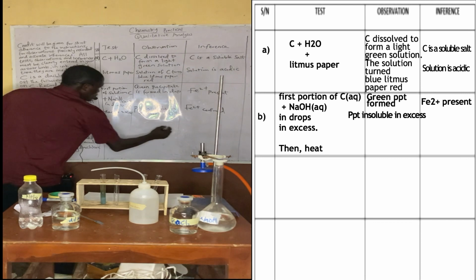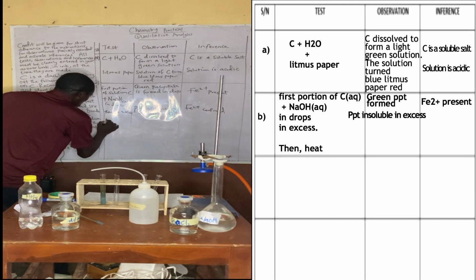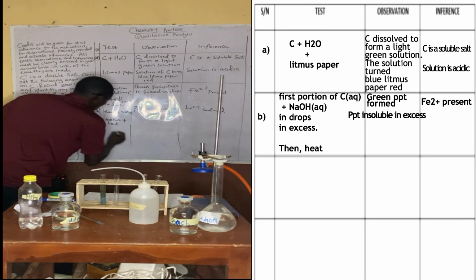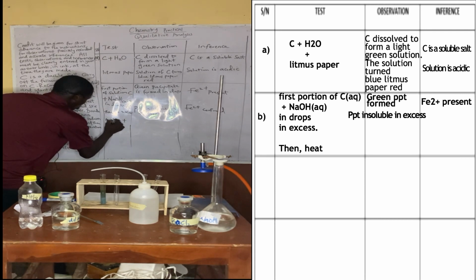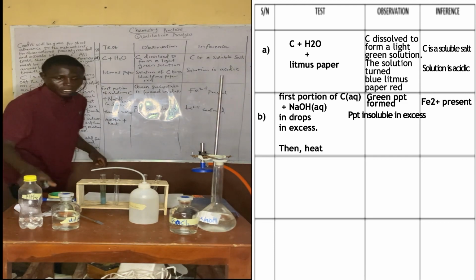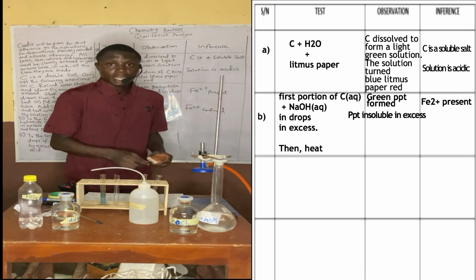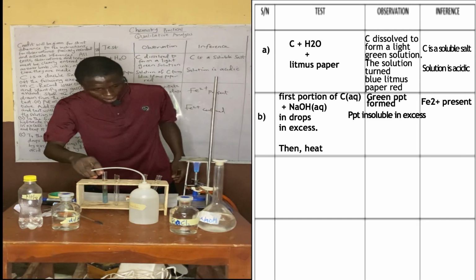Now, the mixture plus heat. Let me see, the mixture plus heat. We have to heat this now.